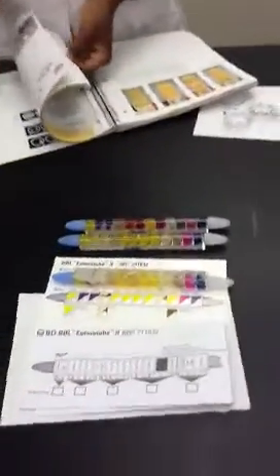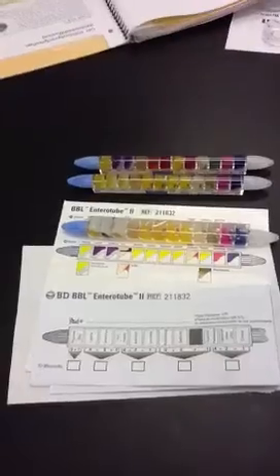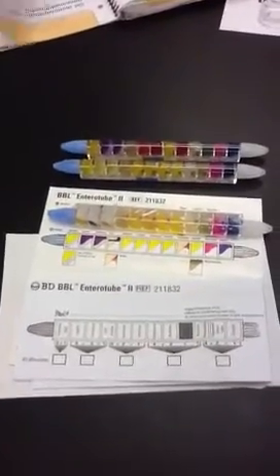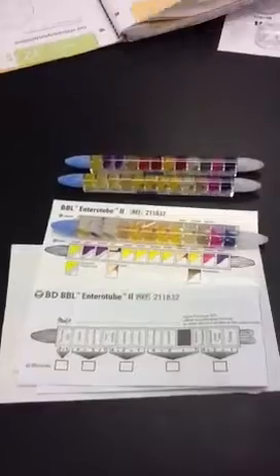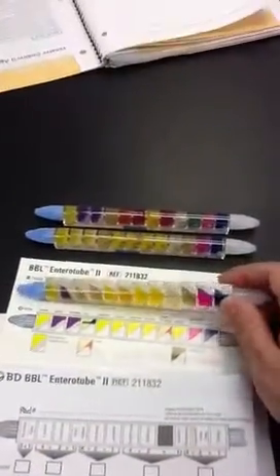And then we have this entero tube, and then we would have to be able to interpret the result for both... To add up the numbers. Add up the numbers and get the correct... I need a little extra time on that. I know. I was thinking the same thing. Can we get a double time on that one? Let's take a look at this.